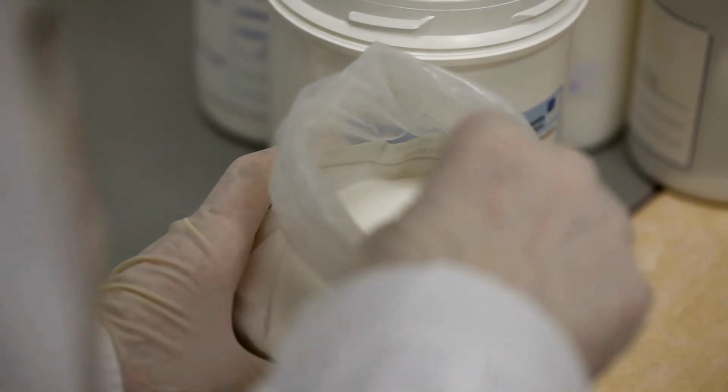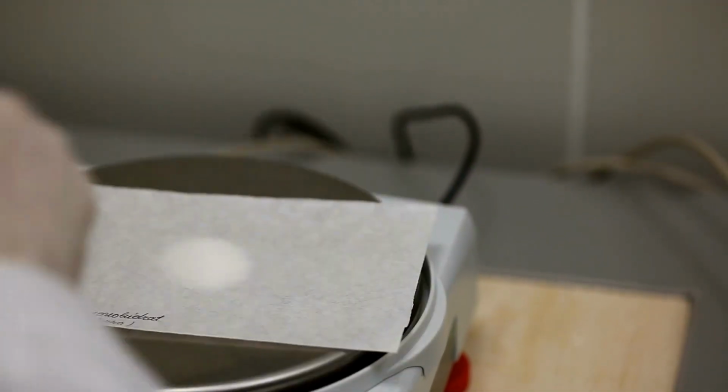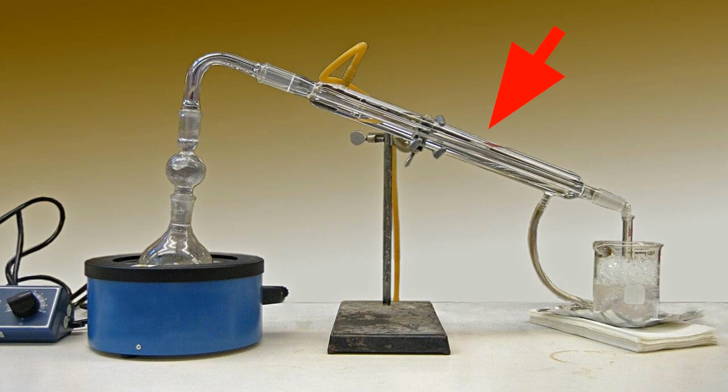We use an electronic balance to measure the mass of an object or substance. More sensitive balances have a greater number of digits after the decimal place. A laboratory glassware we use to cool and condense gases back into liquids is called a condenser. It is often seen as part of the distillation setup.